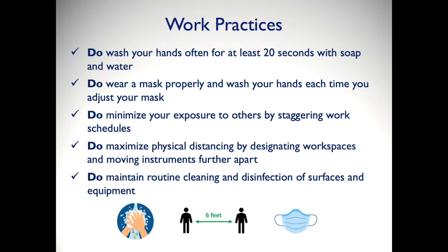Do wash your hands often for at least 20 seconds with soap and water. Do wear a mask properly and wash your hands each time you adjust your mask. Do minimize your exposure to others by staggering work schedules. Do maximize physical distancing by designating workspaces and moving instruments further apart. Do maintain routine cleaning and disinfection of surfaces and equipment.